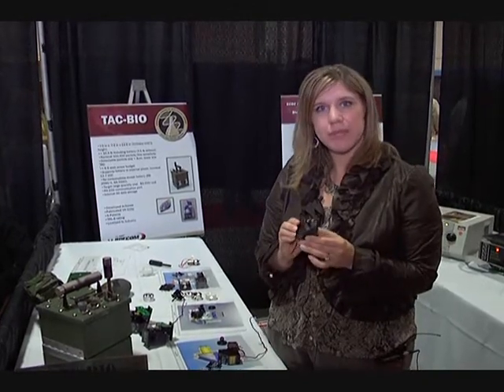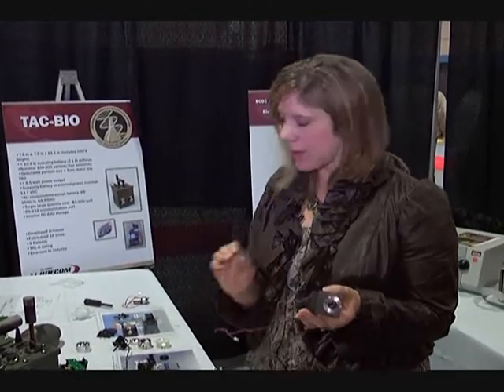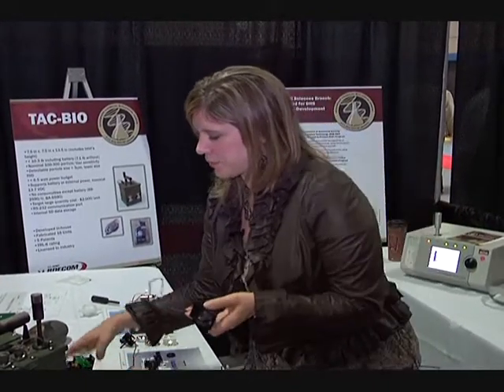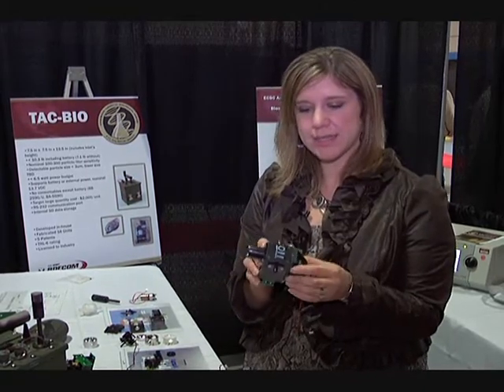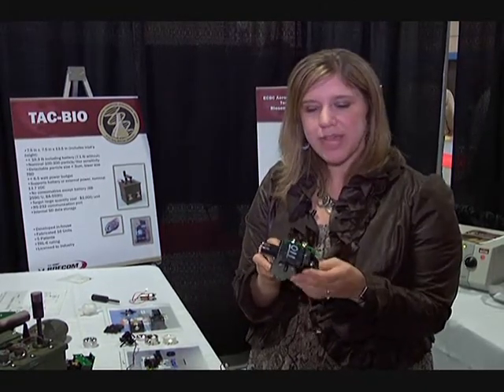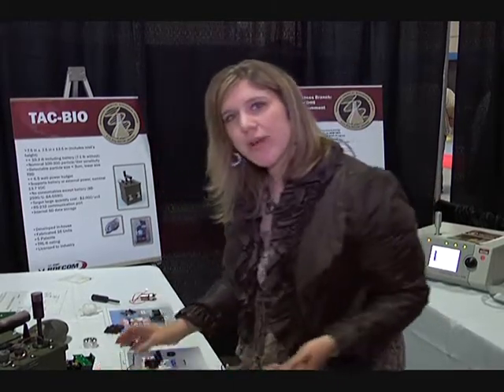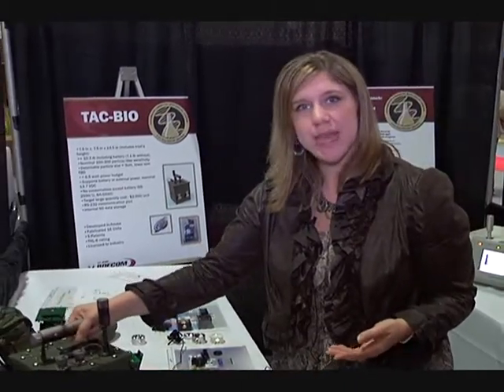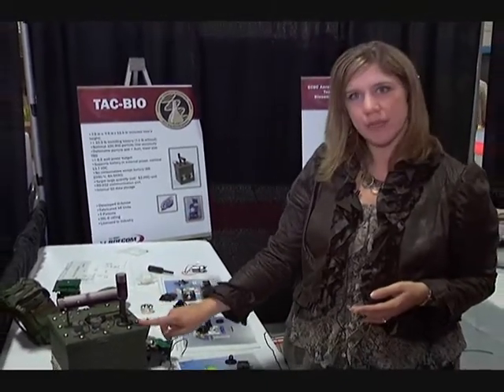This front end assembly can be used in any of our detectors. It goes into our detector such as this, and then we are able to take it from one detector to another. Now the principle of operation is that we use that light source to sample the air that comes through the detector, through this inlet right here.